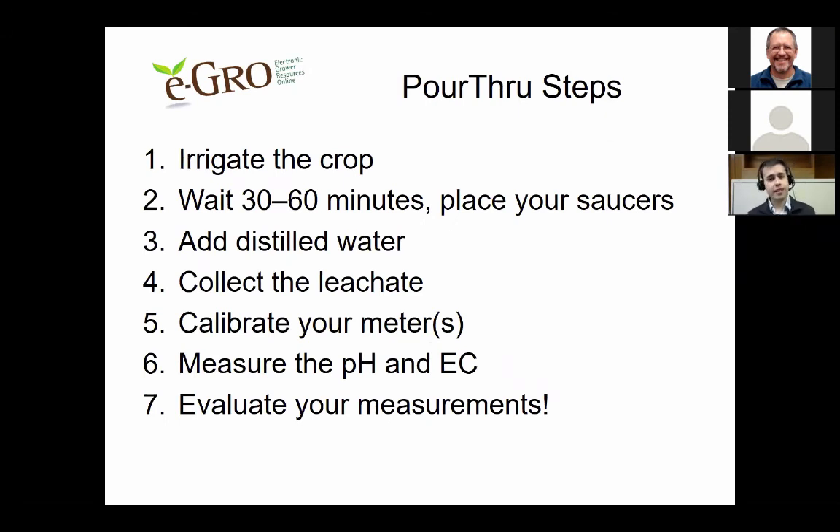To recap the steps: step one, irrigate the crop; step two, wait 30 to 60 minutes then place saucers underneath sample pots or cell packs; step three, add distilled water — volume depends on container size; step four, collect the leachate into a small cup for easy measurement; step five, calibrate your meters; step six, measure pH and EC; step seven, evaluate your measurements to determine if your crop is healthy or needs pH or EC adjustments.